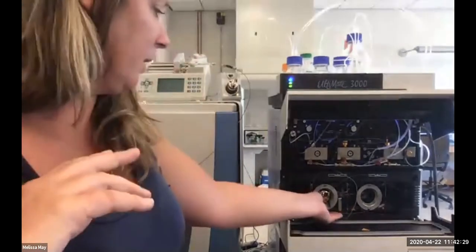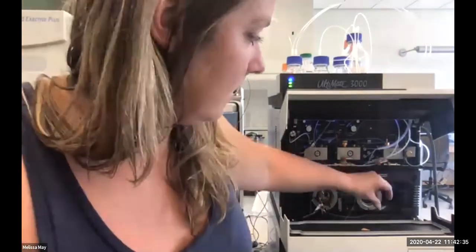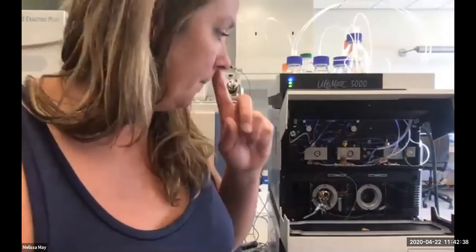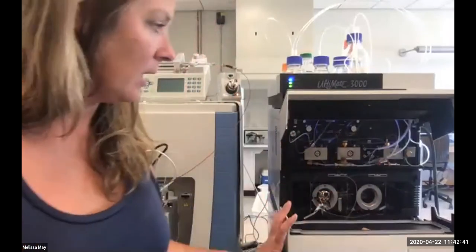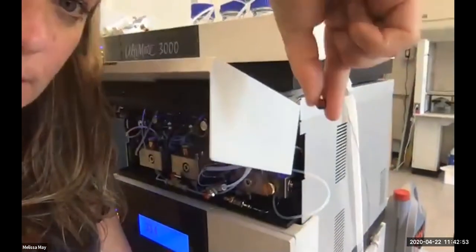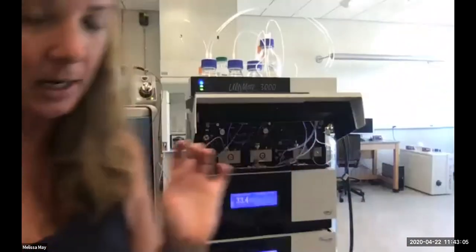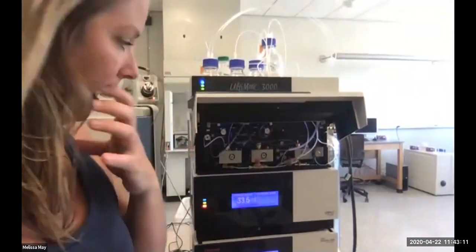And so the column that we're using for this is a really long column. So it's a 25 centimeter column, which needs to be heated. This is one of the nano connectors that's going to keep some of this capillary tubing connected to it. And then right now I have this flowing into the waste. And so this would be where my emitter would be attached onto my column, and this would get sprayed into the instrument. But because I need to keep my loading pumps on and I don't want acetonitrile just evaporating into the air, we're pumping these very small portions out to waste.